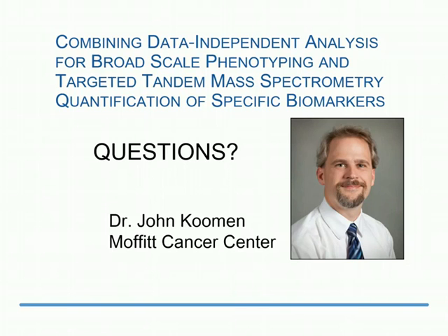So we just have very, very good confidence in the assignment, and even being able to do some limited database searches where you put in just the limited amount of information that you're going to use for your spectral library match to verify your peptide, you'll still get exactly that same assignment. So having really accurate intact peptide mass and 3 to 4 fragments, in most cases, will give you almost unequivocally the peptide match that you've made from the spectral library.